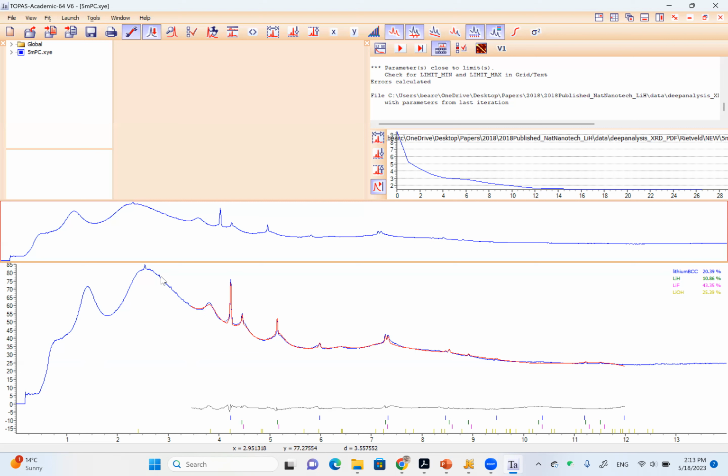And what this is telling us is there are indeed a lot of amorphous components in the sample, right? So you see these big bumps. If you move the cursor to this peak, you see the d-spacing is about 7.4. Do you guys recognize the number? You see the d-spacing in the bottom there. 7.4 angstrom is a very large d-spacing.